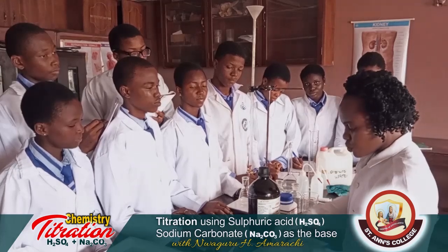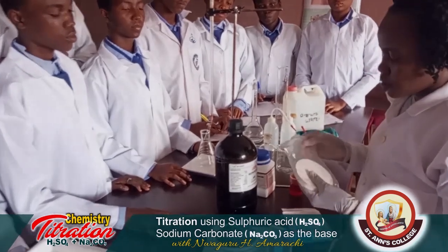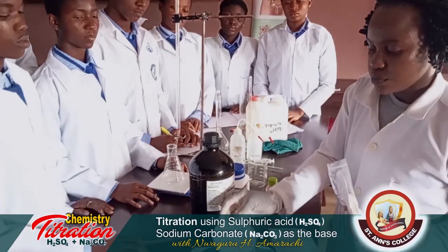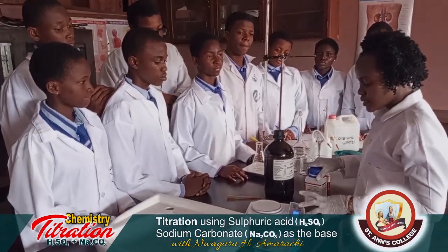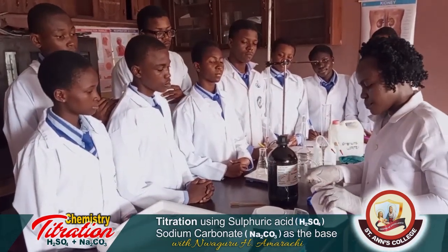This is what we call a weighing balance. We're going to weigh out sodium carbonate. Make sure that your weighing balance is at 0.00 gram. 7 gram.